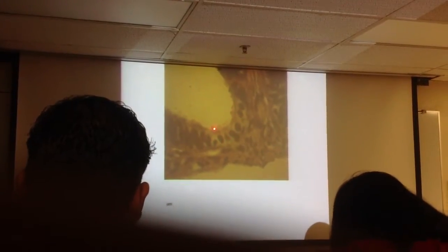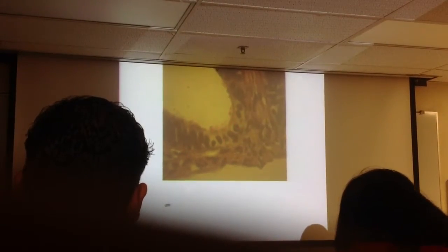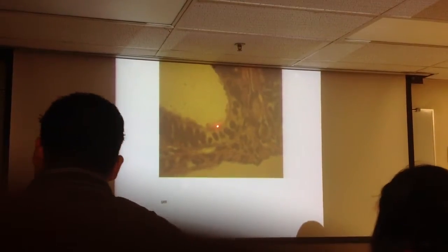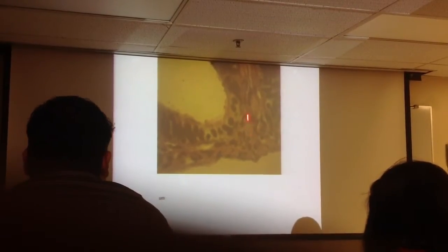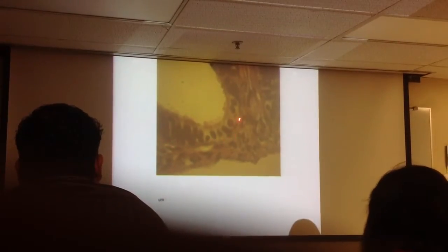Okay, so what type of tissue is this? Simple columnar. No, you left the word out. Ciliated columnar ET. Simple ciliated columnar ET. What's that fuzzy section? What organ is that? Fallopian tube. And then down here you can see where the basement membrane is. You sort of see the line a little clearly there.